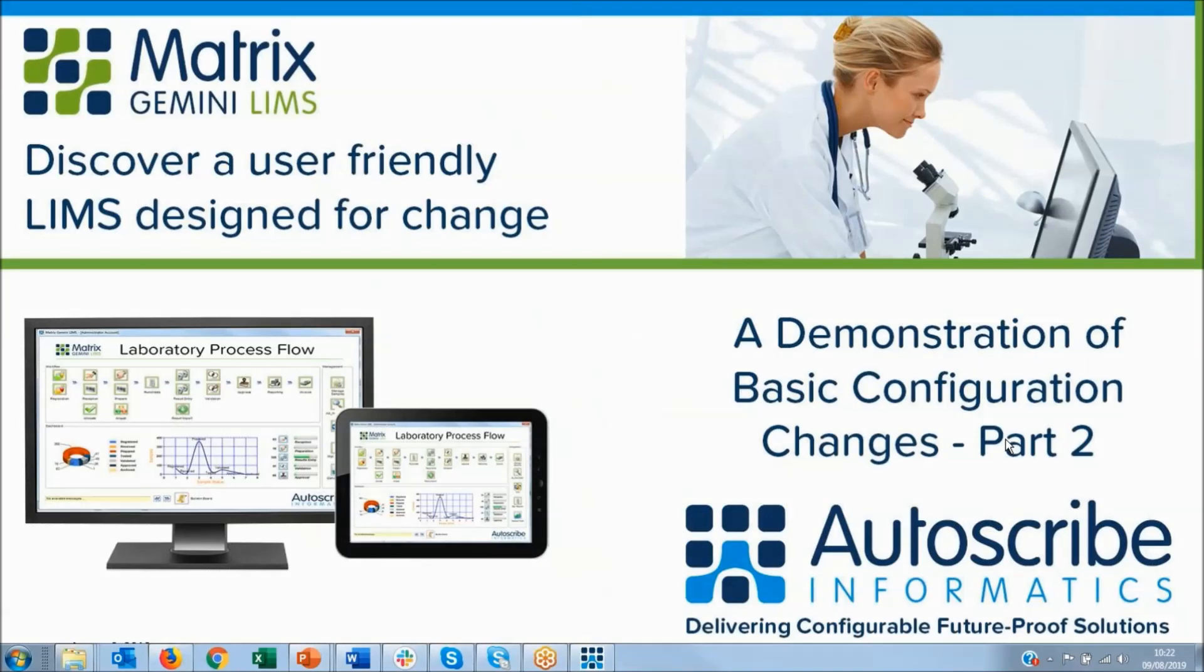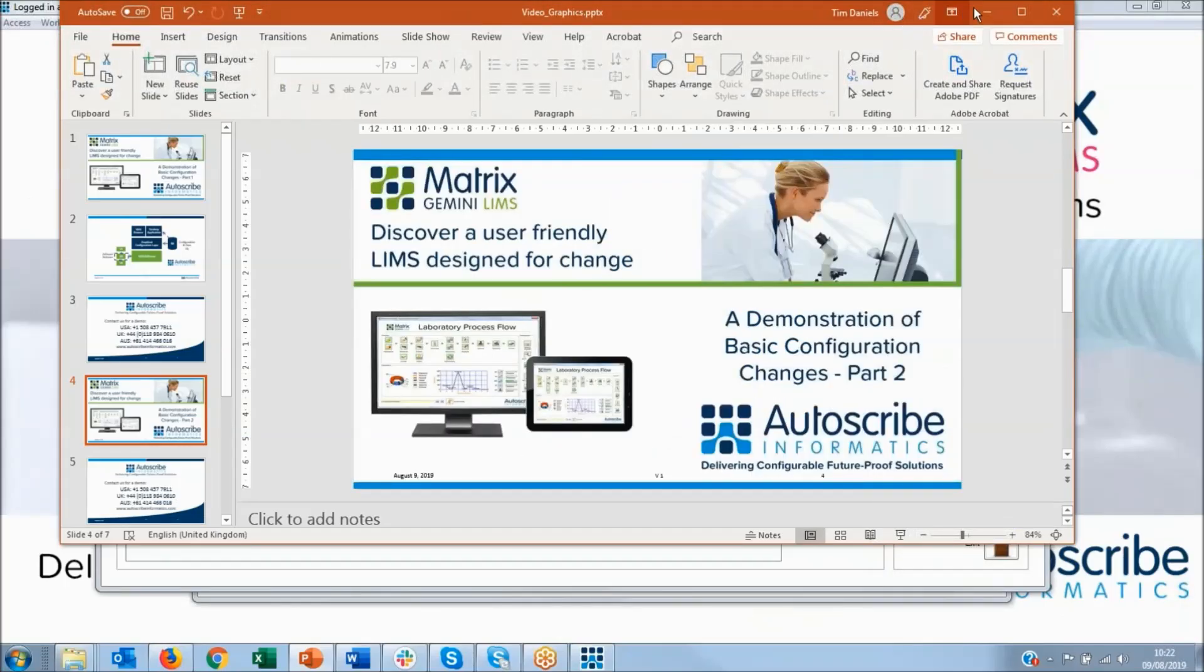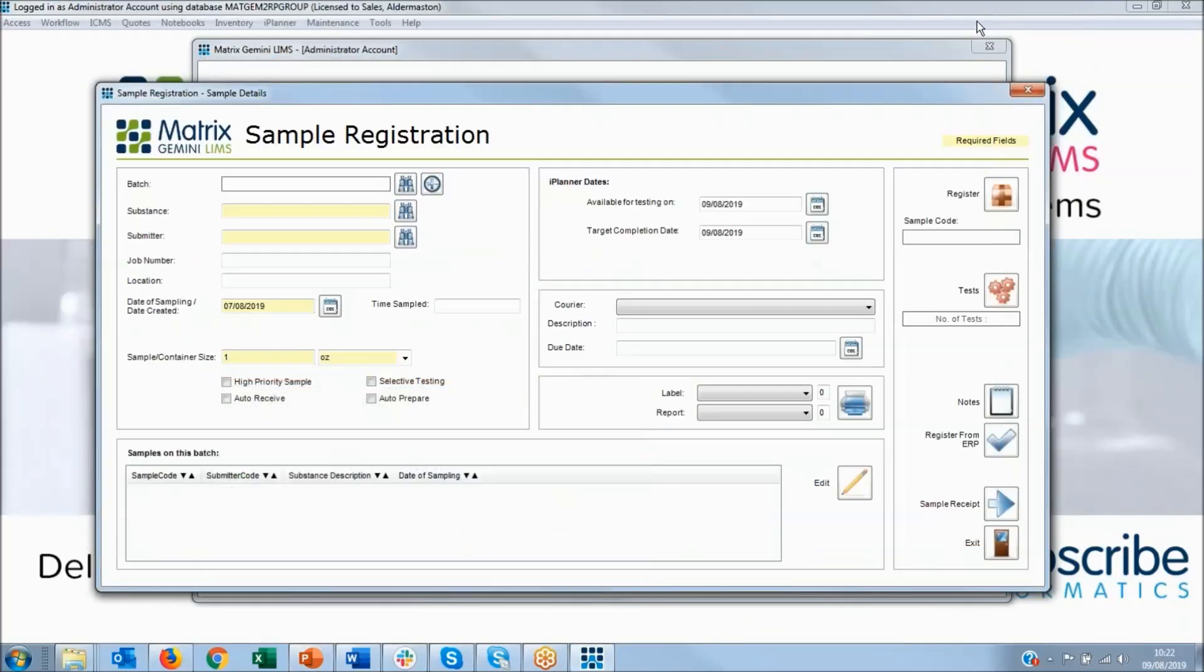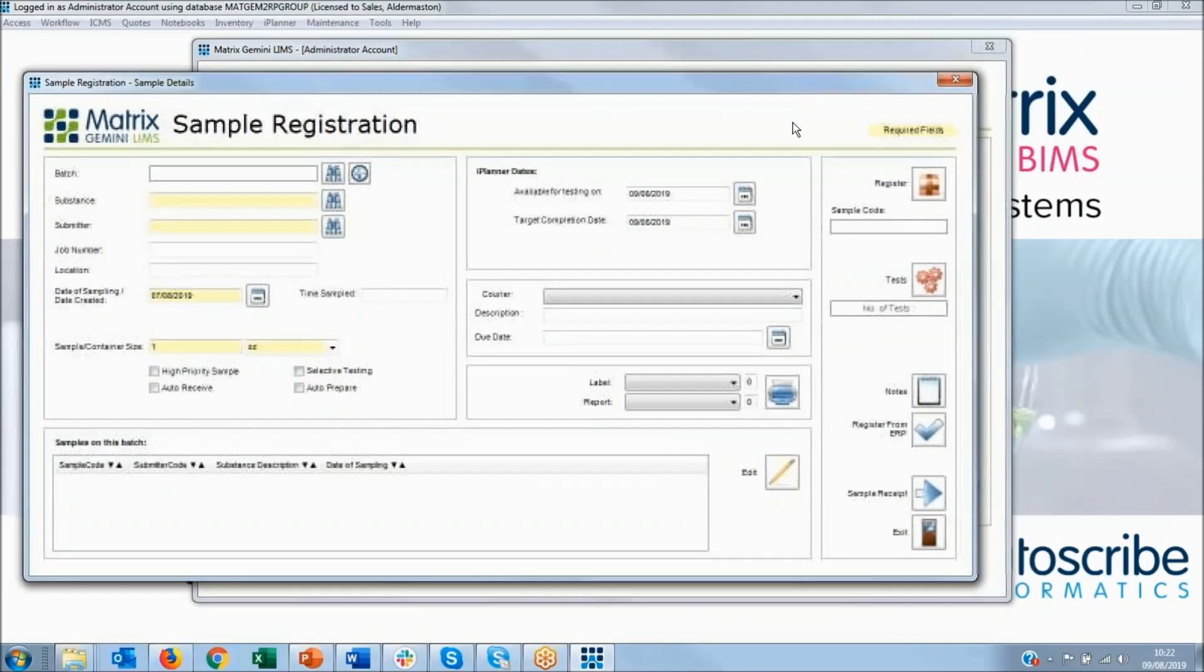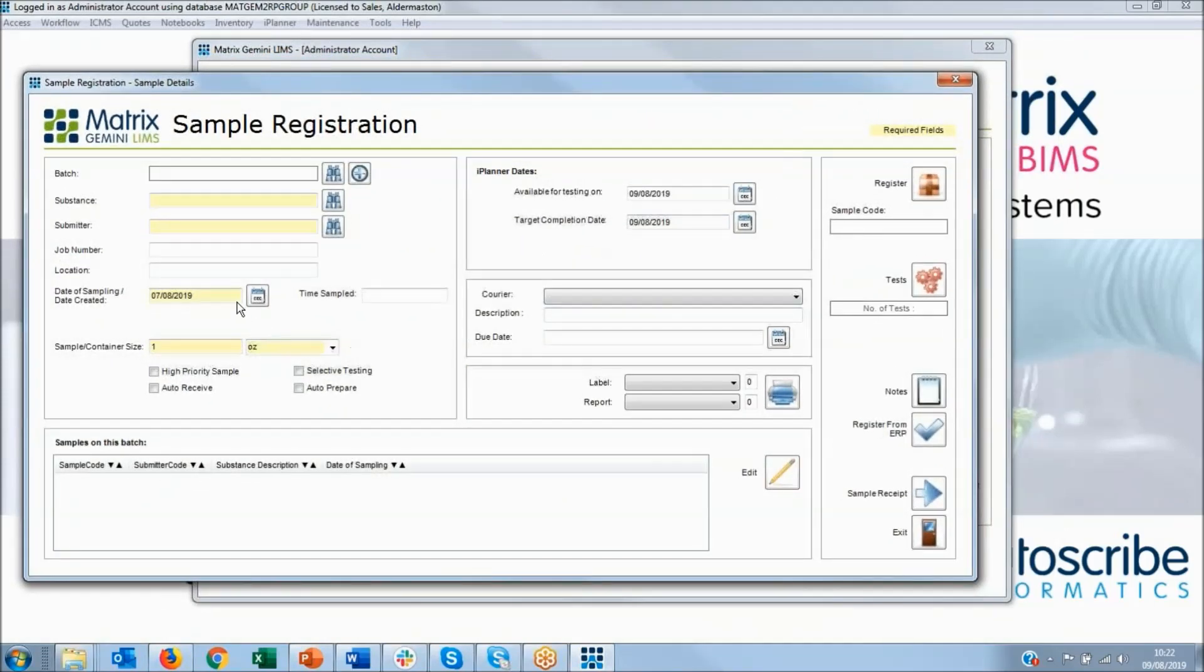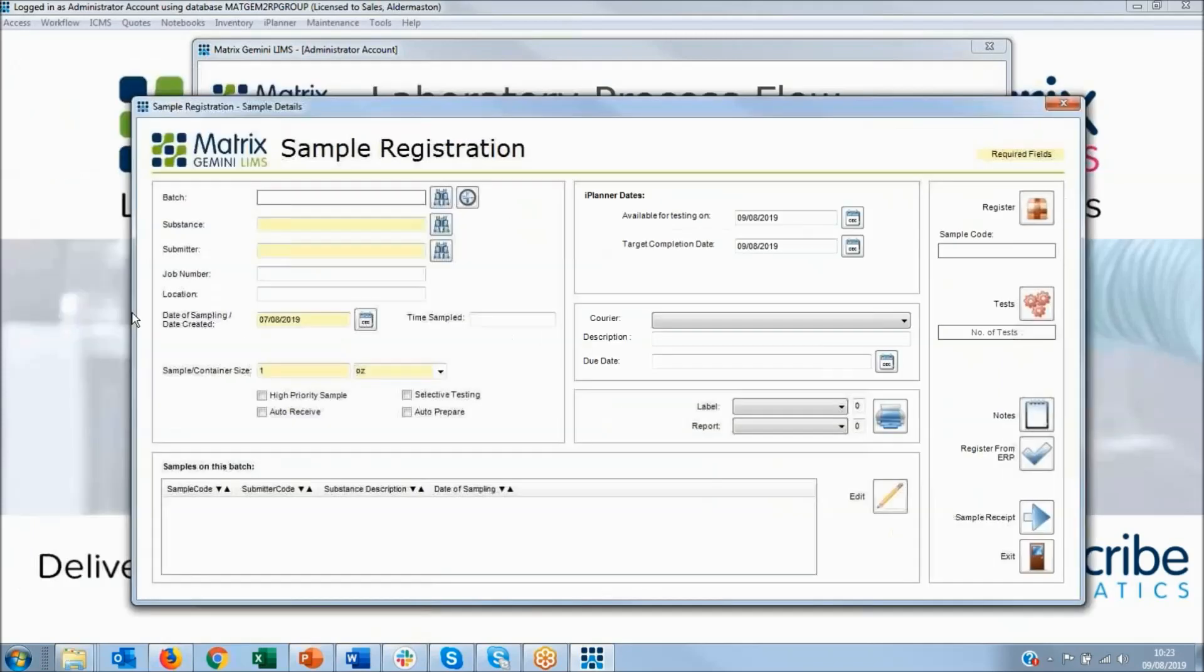In part 1 we showed making a small change to text and adding a text box in the registration screen. So let's go back to the demonstration system. So far we've added a job number and location, and now I'm going to add one or two other little fields in here. So let's put this back into edit mode.